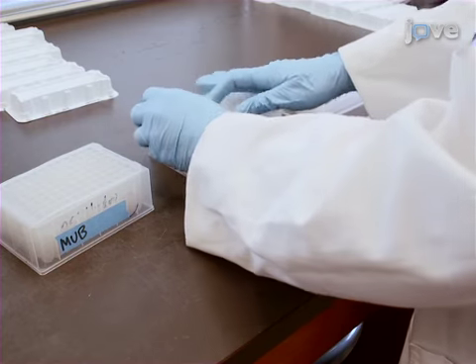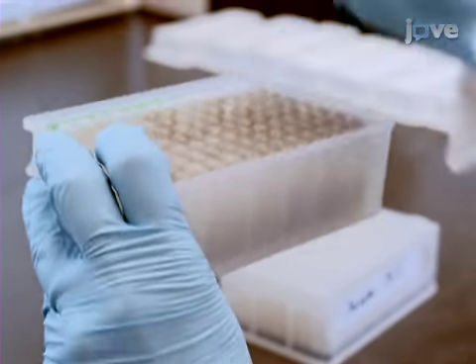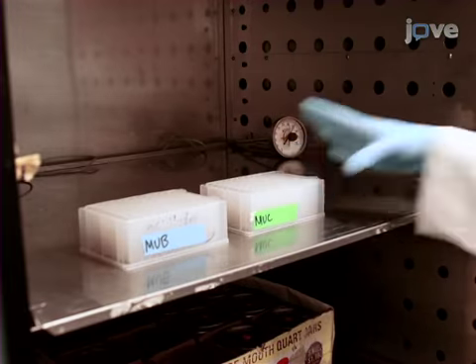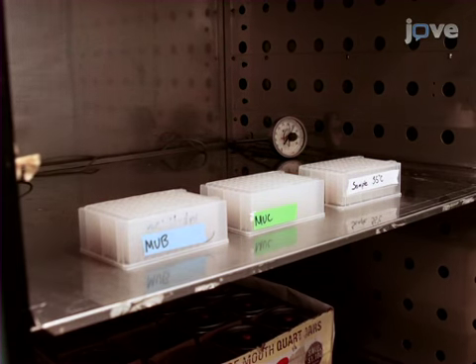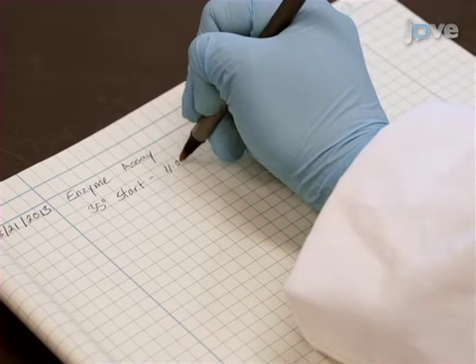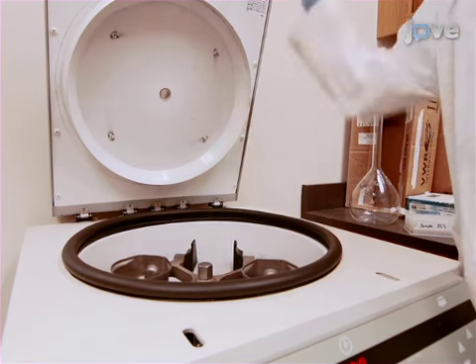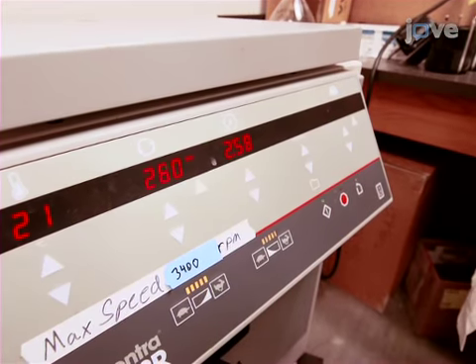Seal the deep well plates with plate mats. Invert each sealed plate by hand until the solution is thoroughly mixed. Place the plates in the appropriate incubator for the required incubation time period as listed in the text protocol. Record the initial time as time 0, as well as the appropriate incubation times. At the end of each incubation period, centrifuge the sealed plates for 3 minutes at approximately 2900 G.